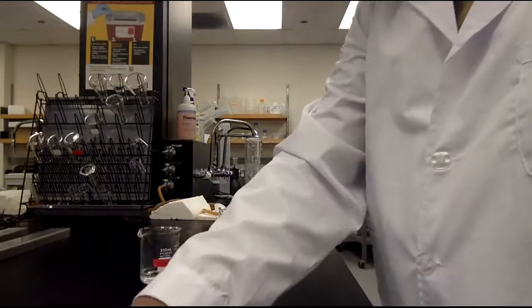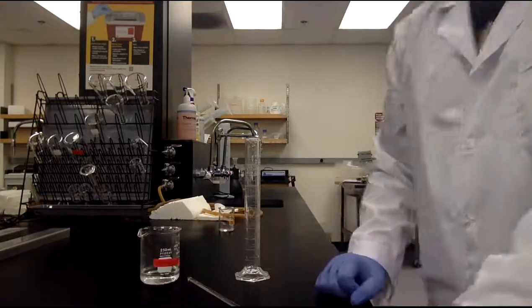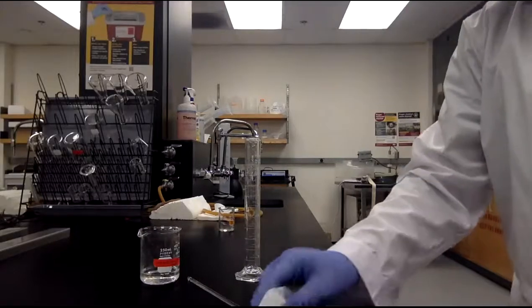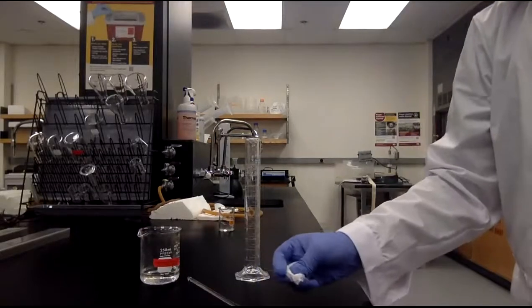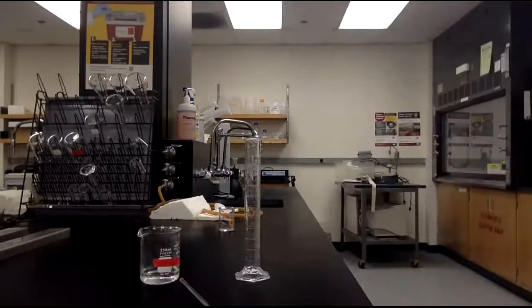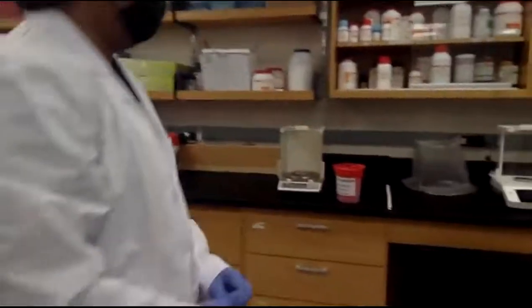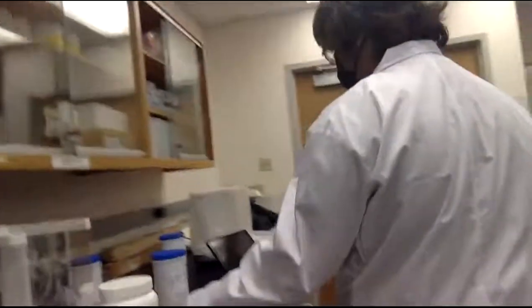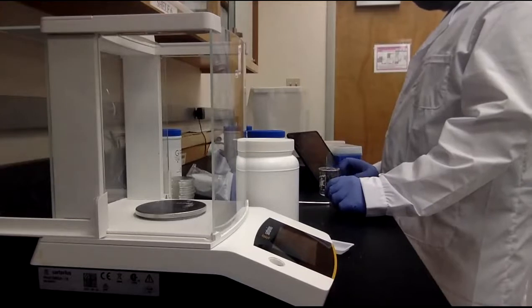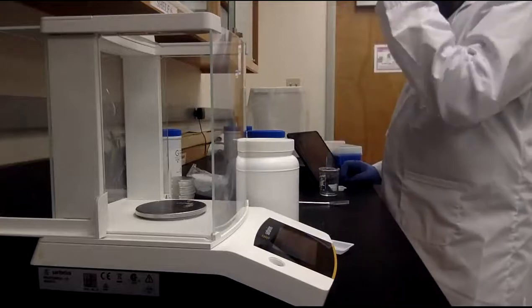Let's go here. So that's the strong base, that's a strong acid. Yeah. Spill, but it looks like not at all, so it's fine, I guess. Not too much. Yeah, it's not too much. It's still around 50. So the final third one. So it's 0.299 grams of the acid and 0.487 grams of the base.